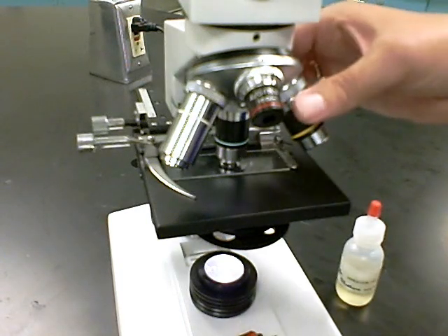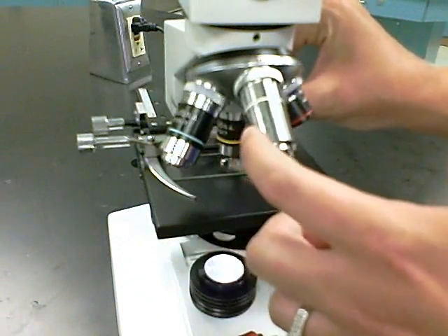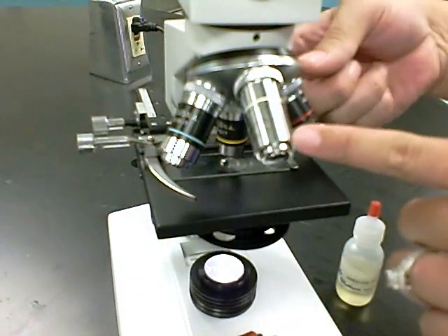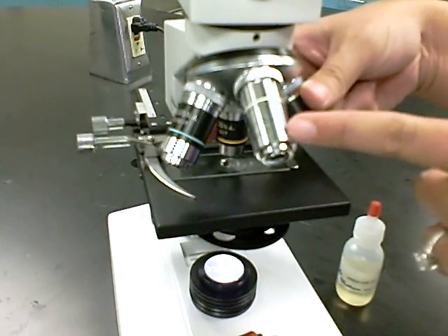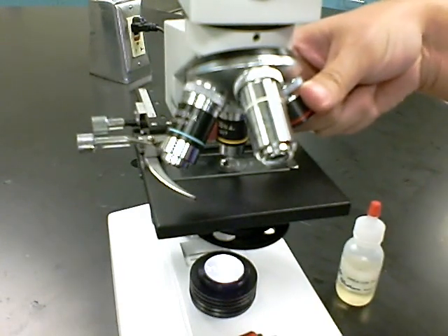You'll notice that some of the microscopes you're going to use will have a 100x objective lens, and this lens is also called the oil immersion lens. Anytime you're using the 100x objective, you have to be using oil immersion.